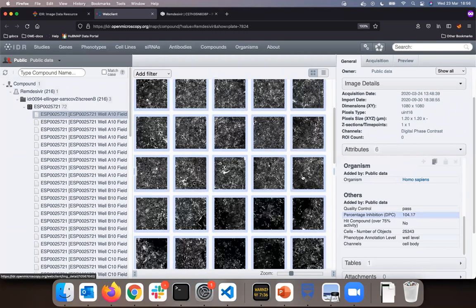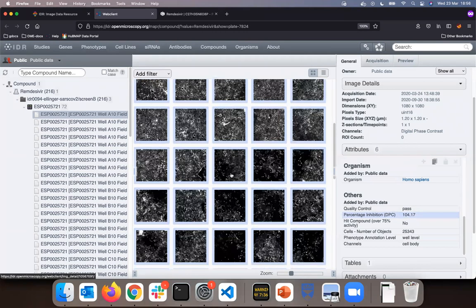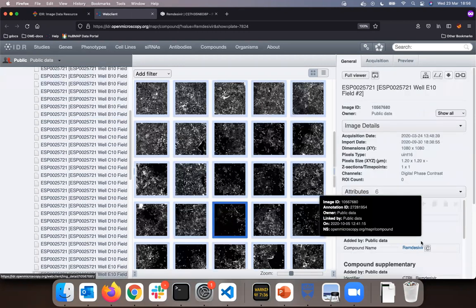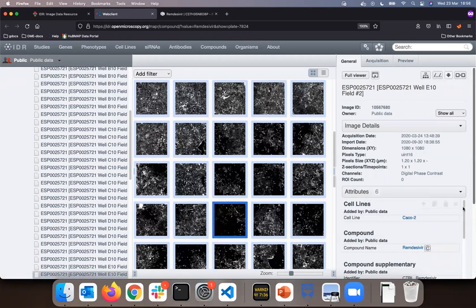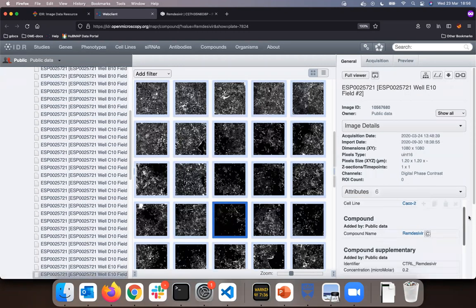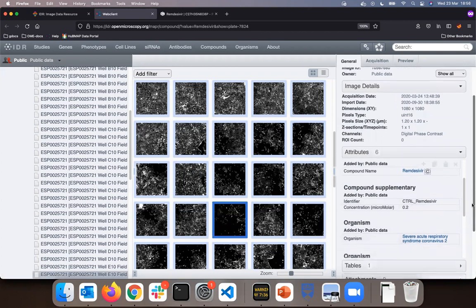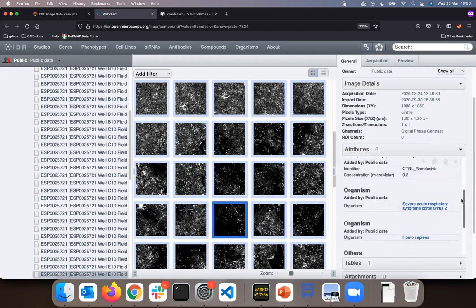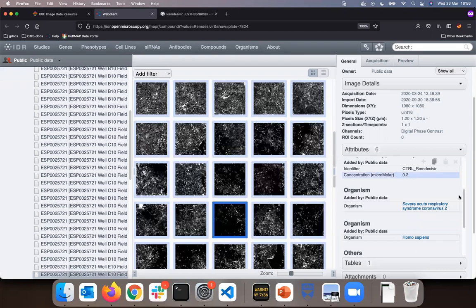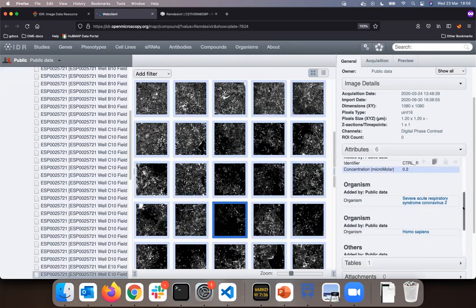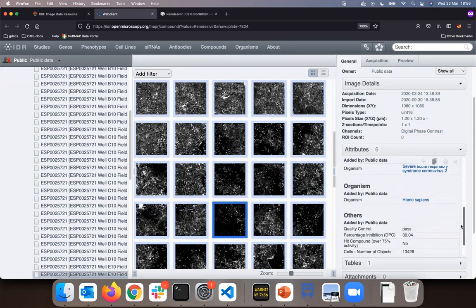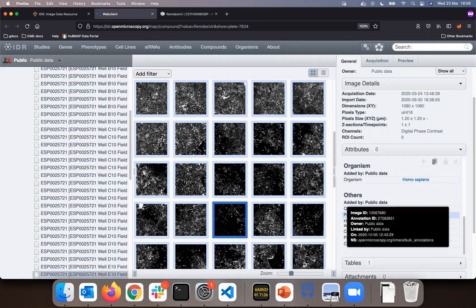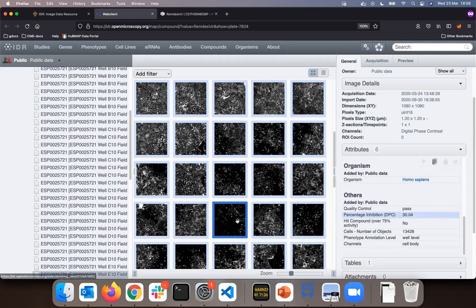If I go to some other image such as this one, and study the metadata on the right-hand pane, I can see that the concentration here was much lower. And I can also see in the others that the DPC is much lower, more than 30, as compared to 104 in the previous case.